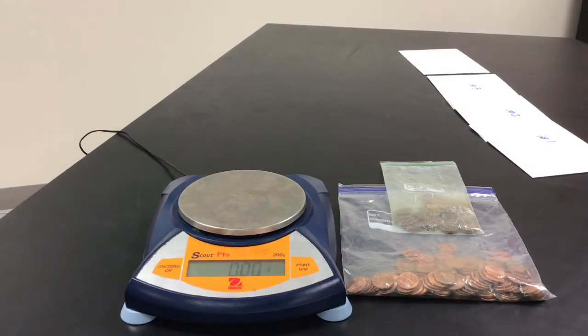This is what we have prepared for the lab: a balance and some pennies from before 1982 and some pennies from after 1982. Number one, obtain a sample of 10 pennies, or whatever number you prefer. At this point, because I'm doing it by myself, I am just going to grab 10 old pennies and 10 new pennies.